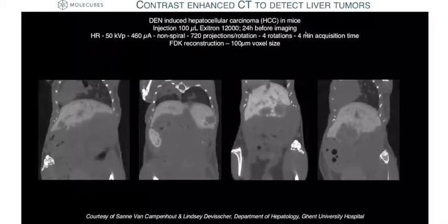And the question to our lab was, so they fine-tuned their animal model a little bit. And the question was, can we see in vivo also this larger tumor mass, which should appear in this modified mouse model.